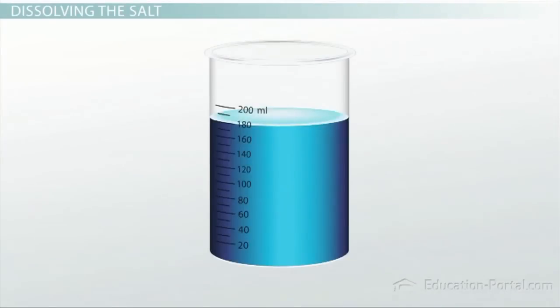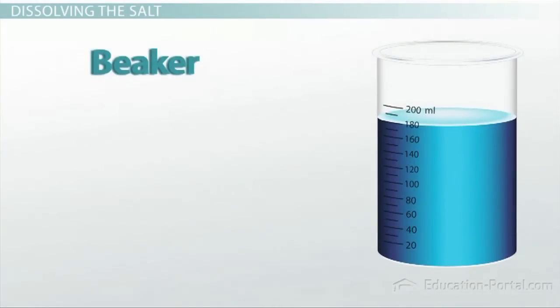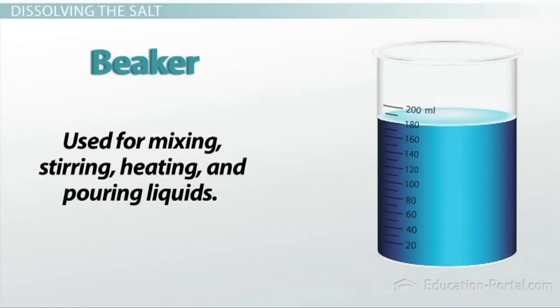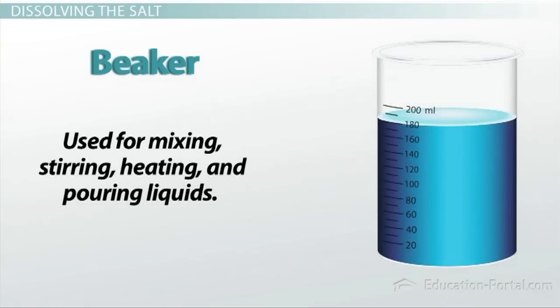Next, we will put our salt into a beaker, add some water, and stir to dissolve the salt to form a solution. Beakers also come in many shapes and sizes, and they usually have volume markings on them. You should never use them to make a precise measurement, though. The volume markings should only be used as approximations. Beakers are used for mixing, stirring, heating, and pouring liquids.